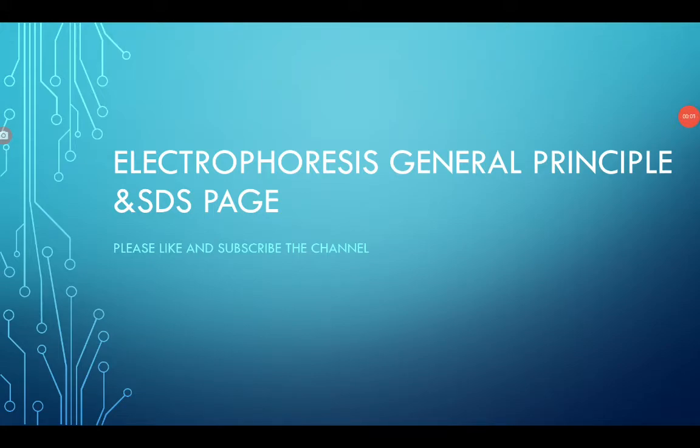Hello everyone. So in this new video we are going to talk about the general principle of electrophoresis and the general principle of SDS-PAGE, which is sodium dodecyl sulfate polyacrylamide gel electrophoresis.